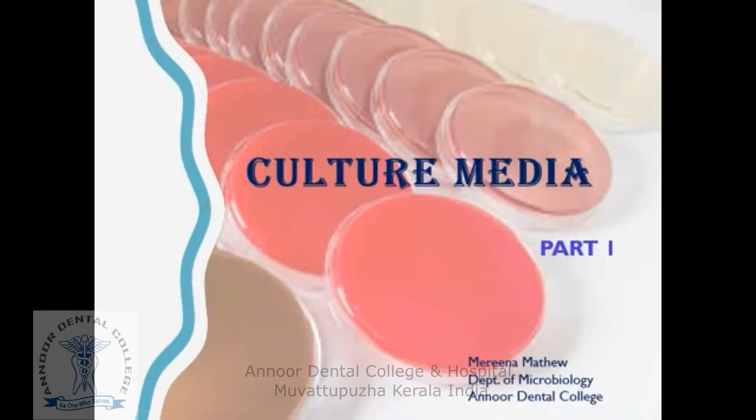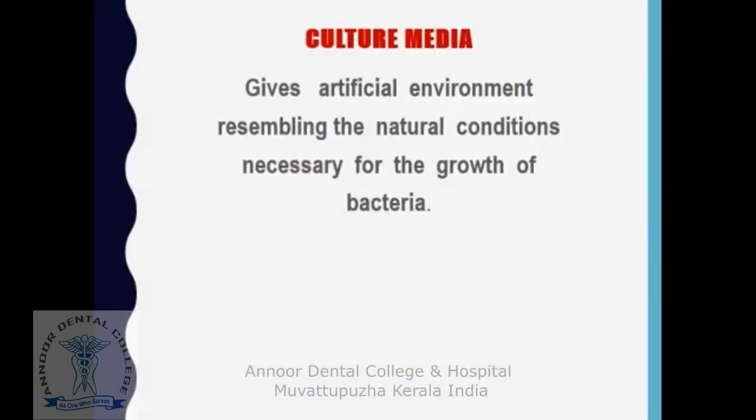Hello all, welcome to another topic in microbiology. The topic is culture media. Culture media is an artificial environment resembling the natural conditions necessary for the growth of bacteria. So we are trying to provide an artificial environment for bacterial growth as culture media.